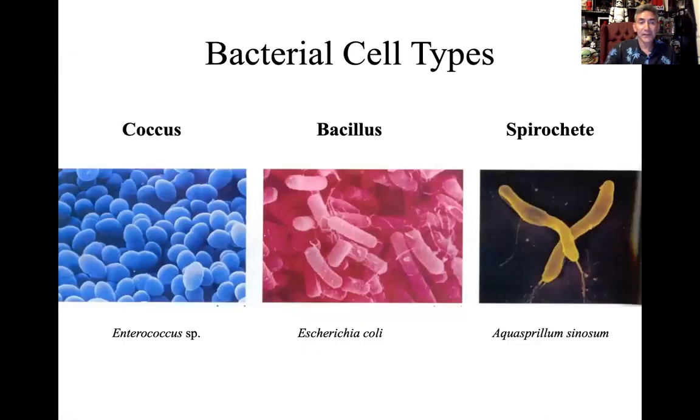So we look at the idea. This is an example of how we would be able to see these under a microscope. You would be able to see a really small roundish bacteria that would fall under the coccus designation. This species is called Enterococcus. So you hear the word coccus in the name, oh, well, that's got to be round, yeah? Entero means sort of internal. So that would be an internal round bacteria. There is some information held, not in the English language, but there's information held in these scientific names.